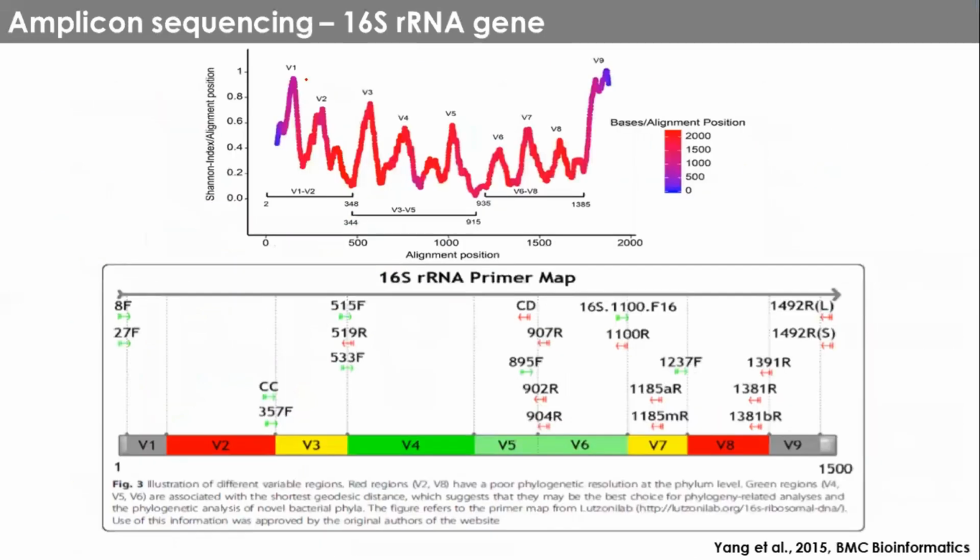Let us further look into how the 16S rRNA genes are located. You have a V1 region, that is a variable region. This variable region is evolved in different species at a different rate. So you will have a lot of variable regions here, but in between you also have conserved sites. These conserved sites will be useful in order to make the primers, because you remember what happens in DNA replication: a primer, a small nucleotide stretch, will go and attach, and then it will initiate the replication, right?